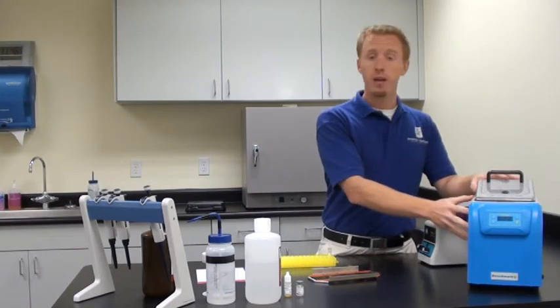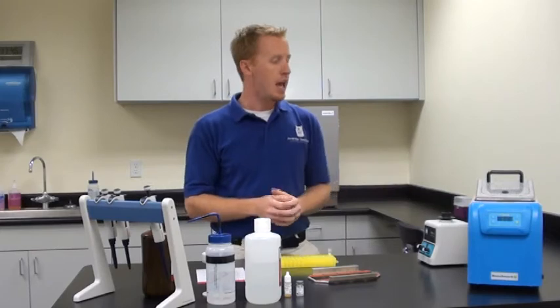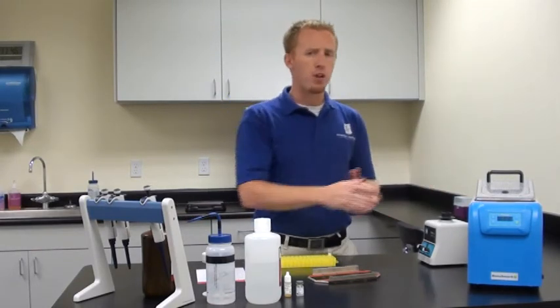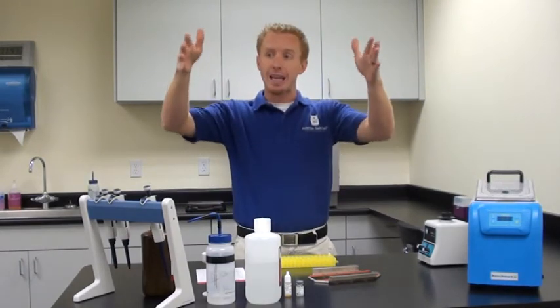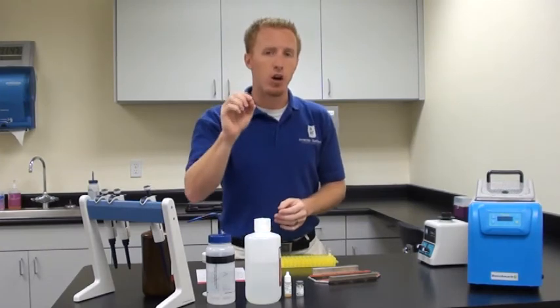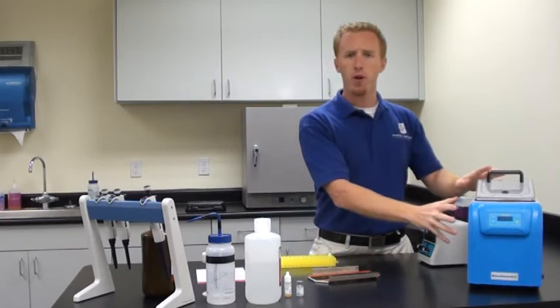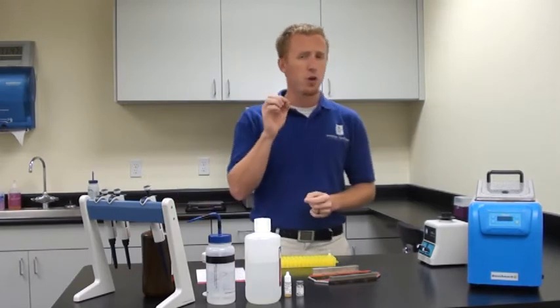It is critical that we do hold the temperature very specifically. If you don't have an oven, you can utilize a humidity water bath such as what you see here. This is called the MyBath. We also have this at American MasterTech. And basically it's a water bath with a lid, and the lid is shaped in a way to allow the water as it evaporates up to trickle back down the sides and go back into the water bath without dripping onto the probe and diluting it. So either way, this is a nice small footprint if you don't already have an oven or some other device you can use to hybridize those probes.